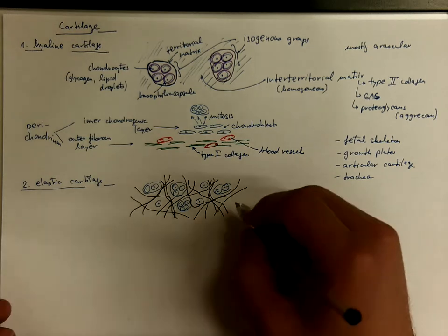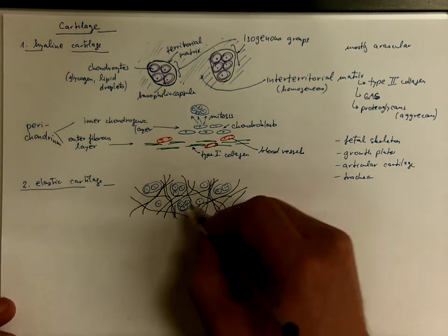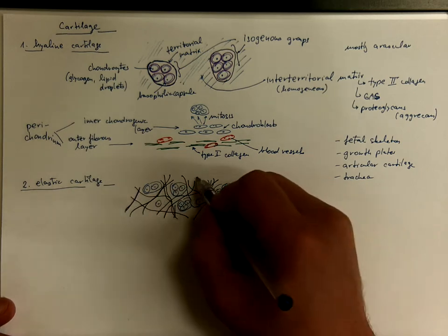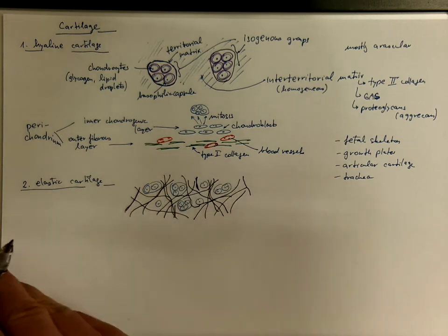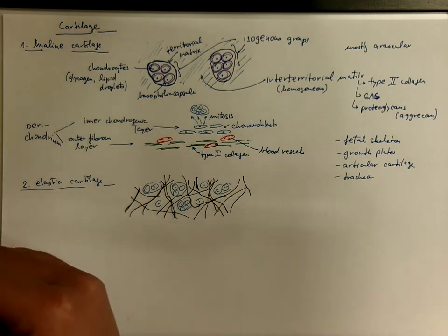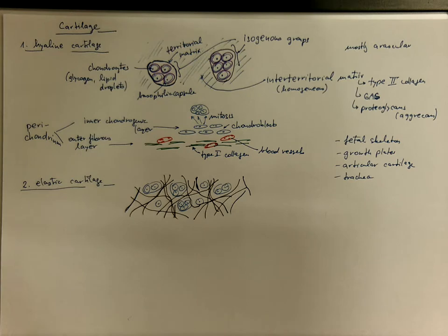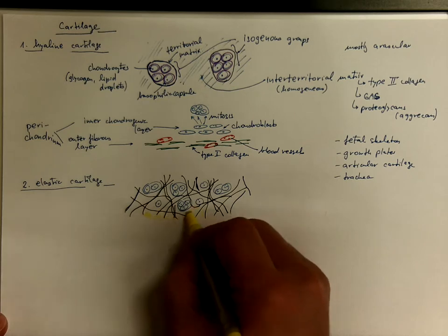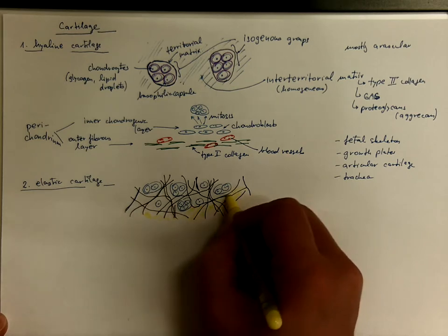Additionally, we got also collagen fibers, so let's label it. Well, and of course the ground substance everywhere. Lots of ground substance.